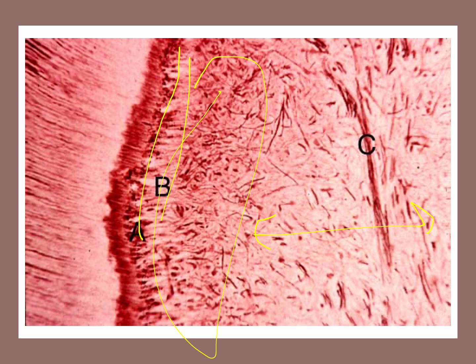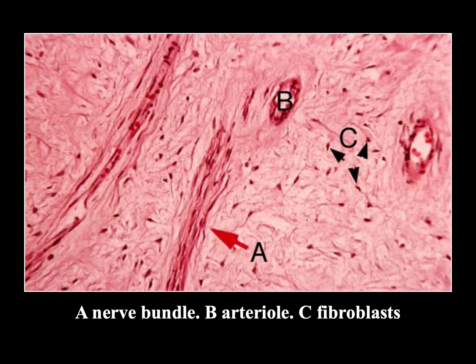This is the nerve, and you can see the nerve terminals here making some kind of plexus. This is the plexus of Raschkow. In a higher magnification, it's a woven wool appearance with light and dark, red and pink here.